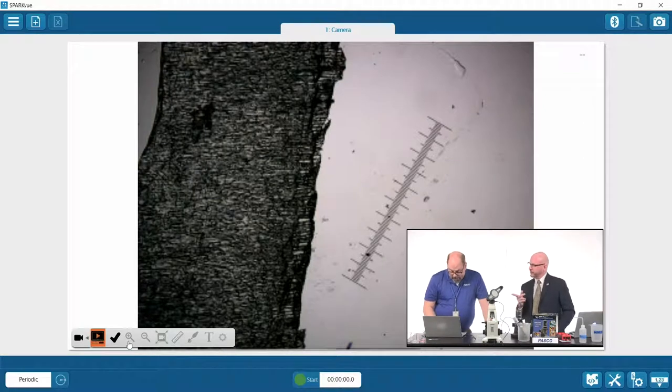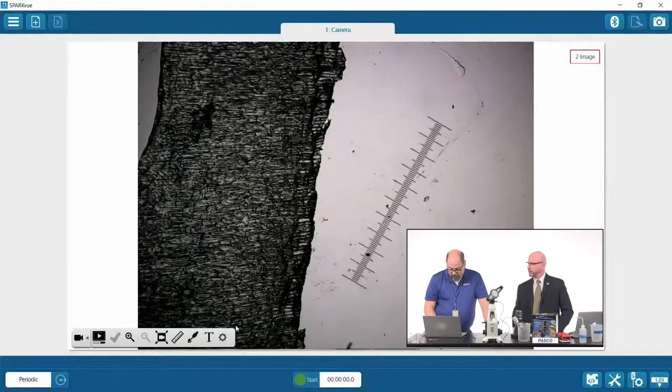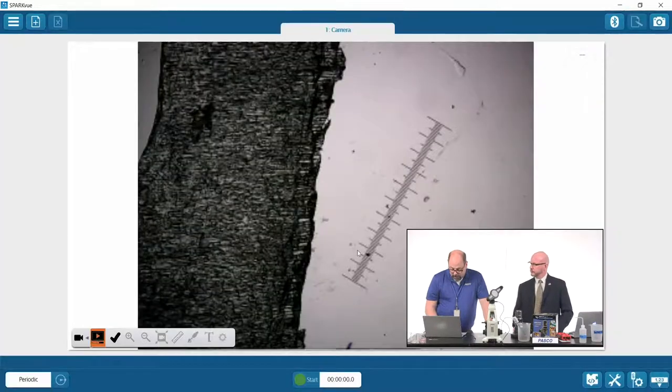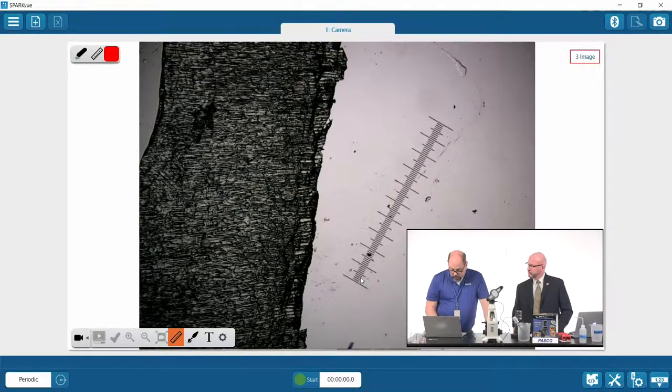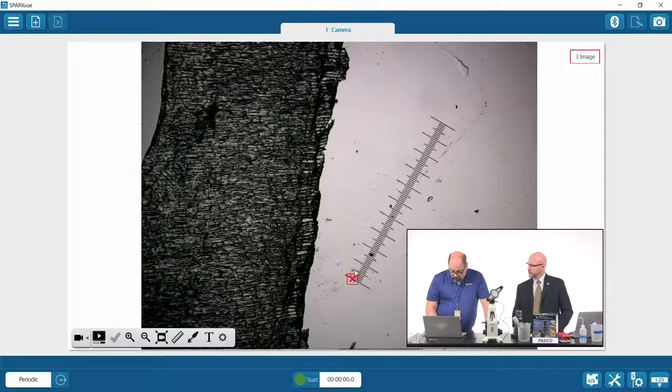Roger, this is awesome because not only do you have the prepared onion chunk, but you've inserted the measurement piece. And so just as I can come in here and have done previously, I just want to show you, if we have a pre-measured slide, go ahead and take that picture so that it's saved. I can now bring up the ruler tool. And if you've got these pre-marked slides, let's grab the ruler and come in and pull those through.